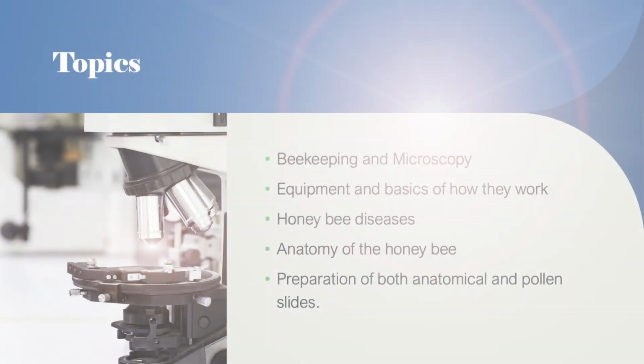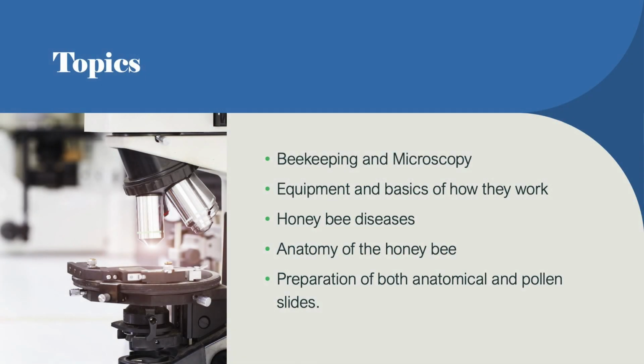I design internet networks. So it couldn't be any further from where we are today. What I'm going to try and do, and it's really quite an ambitious talk for the next hour, is introduce you to microscopy. You'll maybe get some of the passion which I have for it. And then I'm going to just briefly cover each aspect of producing slides and the types of slides you want to do.